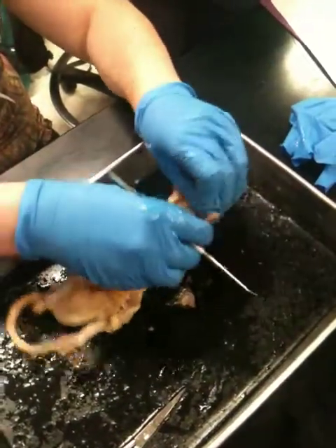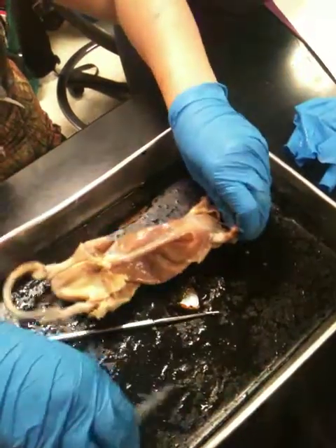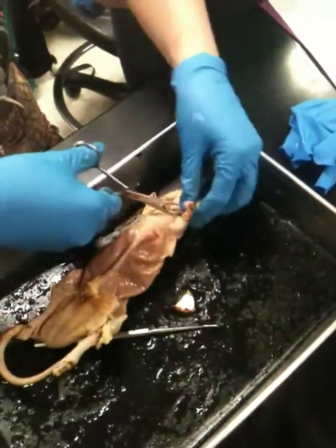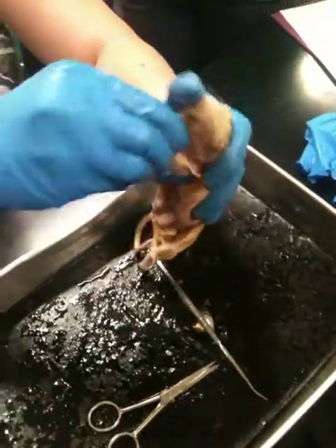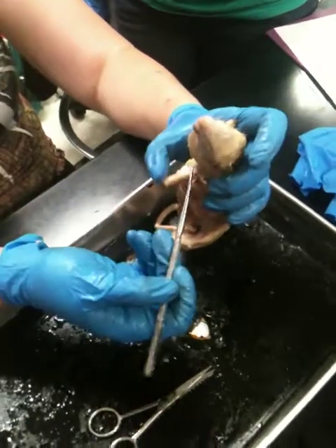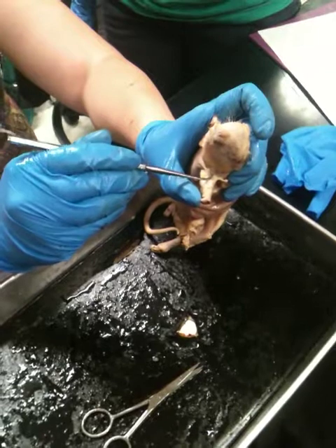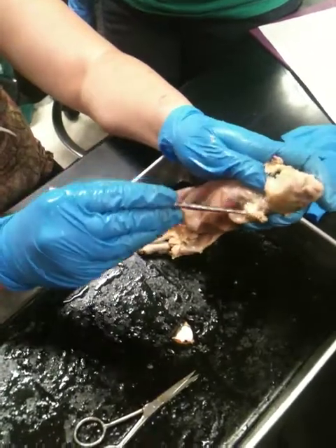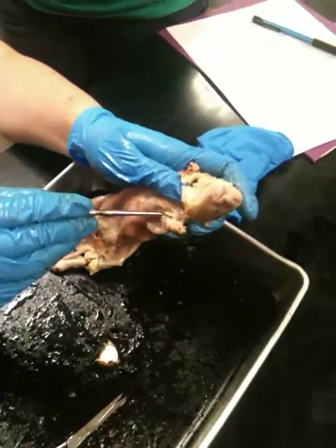Now this rat definitely is a little challenging. I may have to break it only because I want to be able to move it around, and right now I can't. Okay, so we're actually seeing this elbow right here. If we go towards the front of the bend right here, this is going to be the antecubital. This over here is going to be the antebrachial, the forearm.